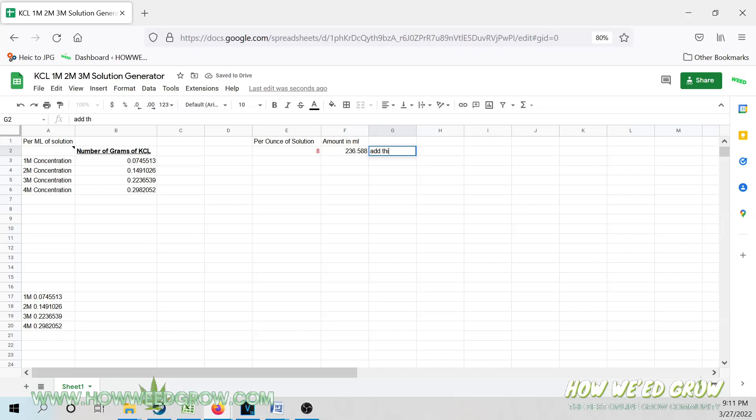Now I just take this figure and plug it in on the left, and it will calculate all of the amounts of KCL powder I need for different concentrations. Since I'm making a 3M solution, I'll need 52.91 grams of KCL.